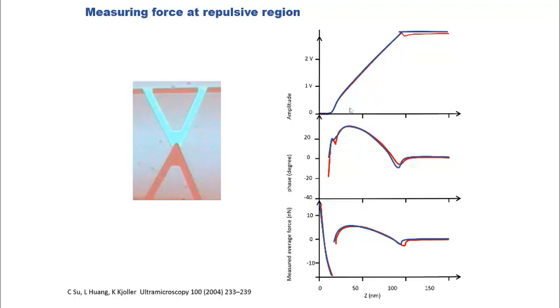This is a very interesting experiment, and you can actually measure this force by tapping on a cantilever with another cantilever. So you can use one cantilever to do tapping or AC mode, AC interaction, by manipulating its drive and set point, and use another cantilever, using its deflection signal, to measure the repulsive and attractive force. And then you can see here that it resembles some kind of force curve, and now you can tell that even in AC or tapping mode, tip and sample still have a force, and it will have its attractive region and repulsive region, just like a static force curve.